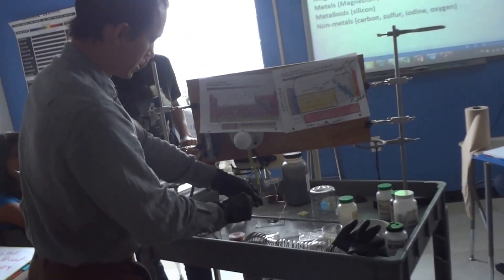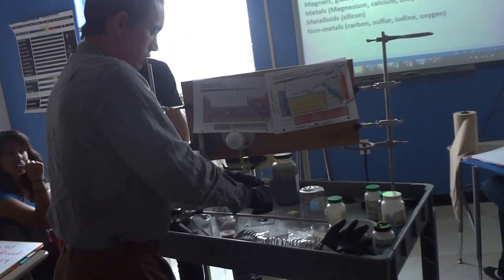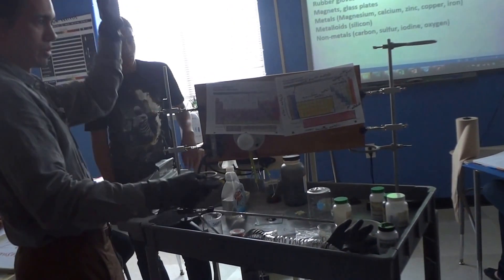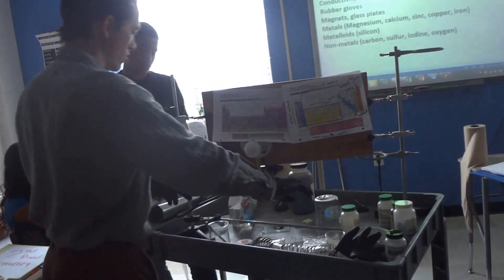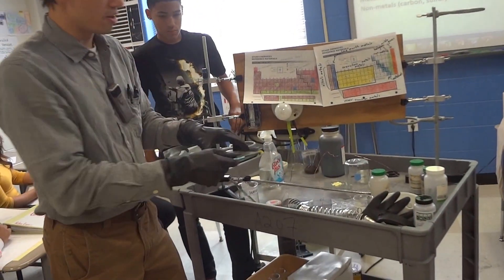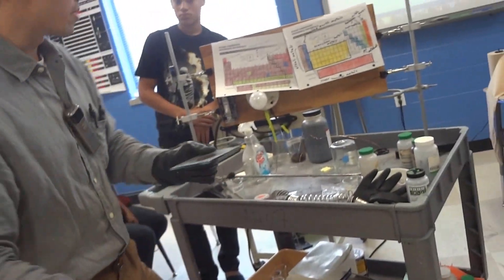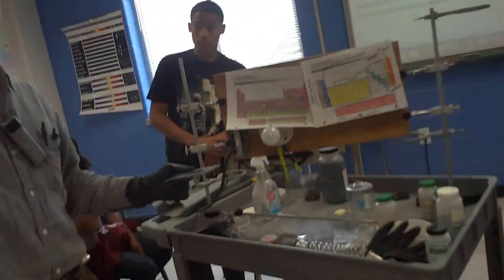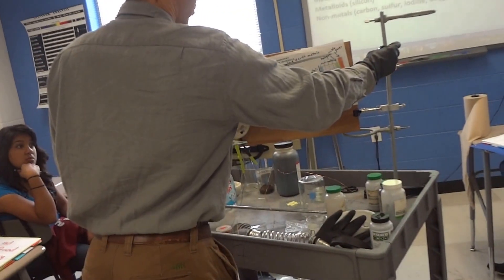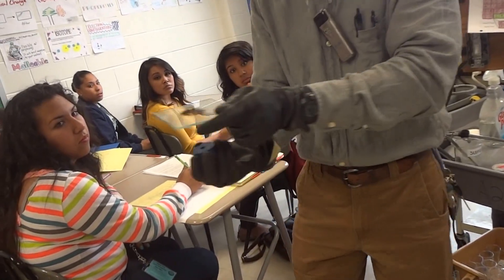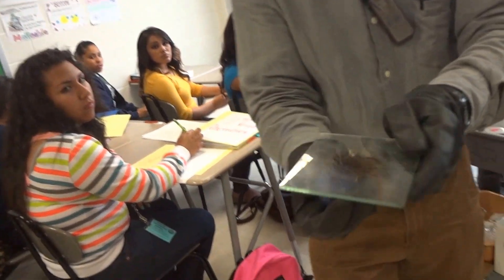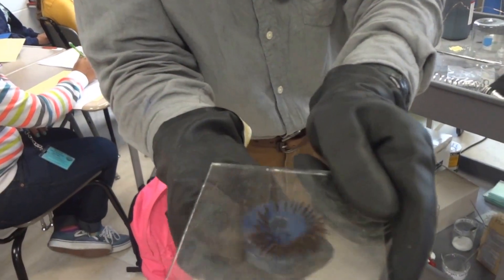Now we're going to test one more property: magnetism. All these metals are good conductors — would they all be magnetic? Let's test it. Here I have iron powder, and I'm going to take this magnet. Watch — it sticks to the steel rod, which has iron in it. When I move the magnet toward the iron powder, it pushes it up and you can move it around. Iron is definitely magnetic.